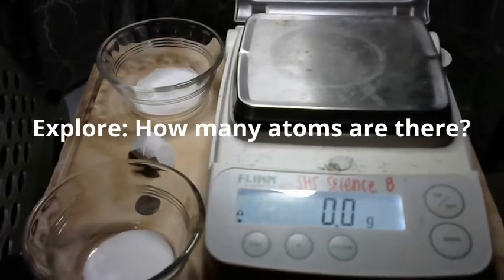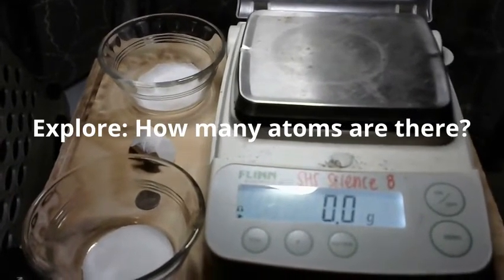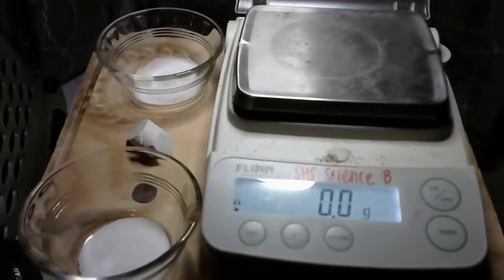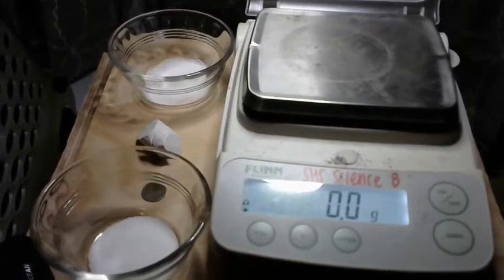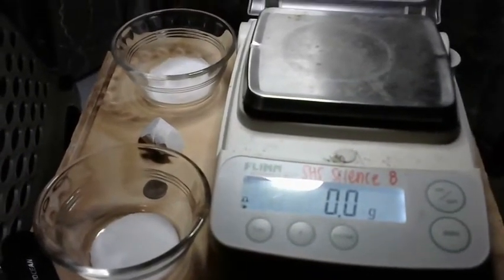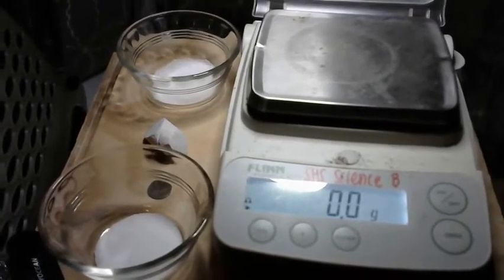This is going to be the data for the how many atoms are there lab. This data is being collected for any of the students who are distance learners or for some reason are not able to make it to school this week for our lab that we're going to do in person.